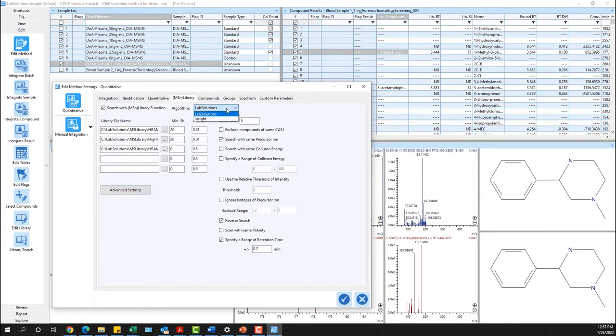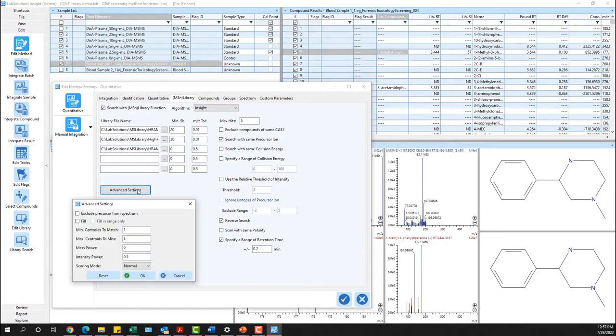The Insight algorithm is only available within Shimadzu's LabSolutions Insight Explore software. It allows for enhanced library screening search parameters.